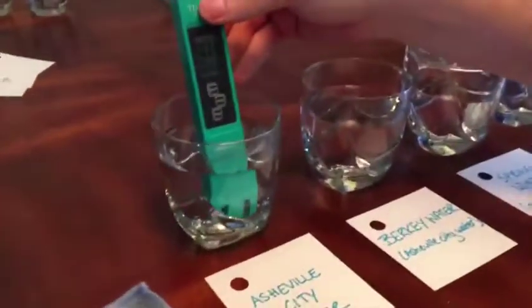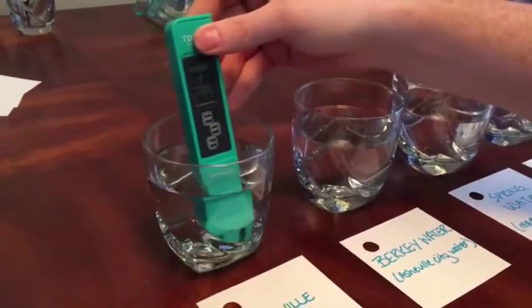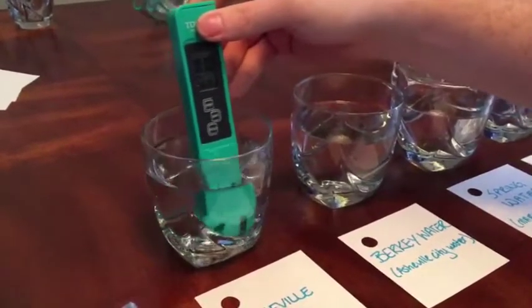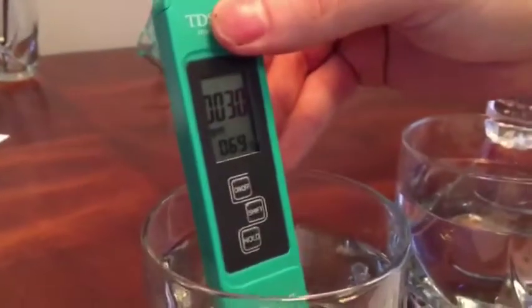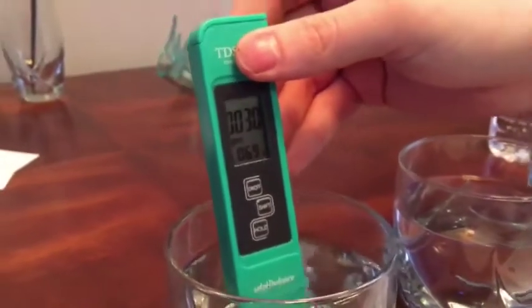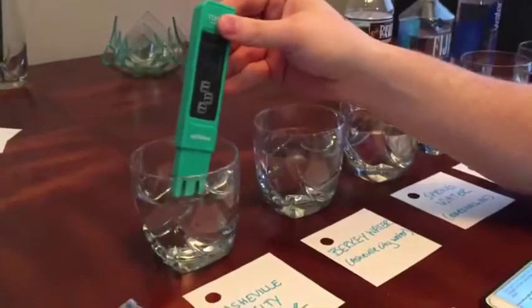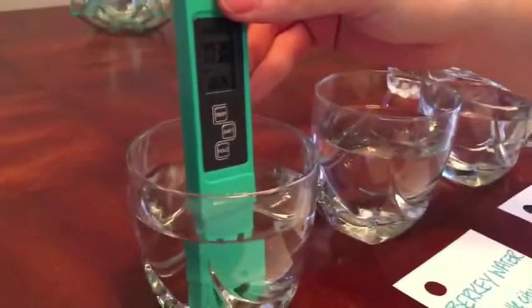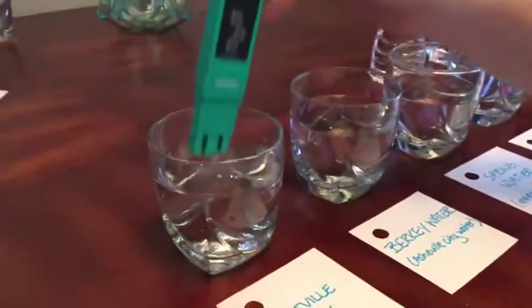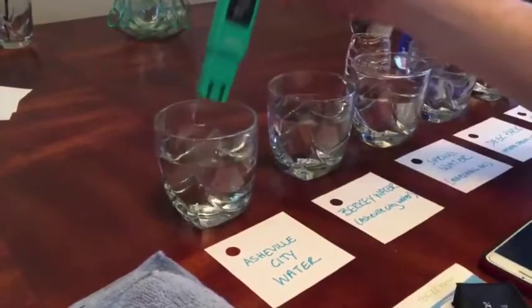What's good is you don't want to submerge too far, and the slight agitation motion's pretty good just to make sure you get a consistent reading. And looks like the reading here is 30 parts per million dissolved solids. Now, ideally, perfectly clean water is going to be very close to 0. So this right here, Asheville is highly chlorinated and fluoridated. There's just a lot of chemicals because there's a lot of water getting reused here, so they have to use extra chemicals.